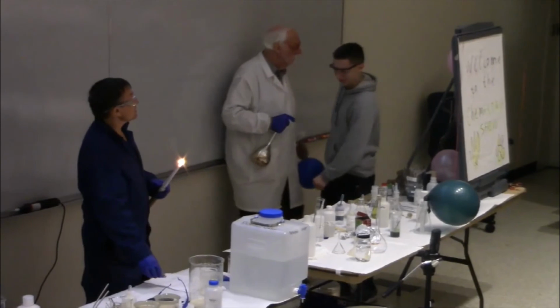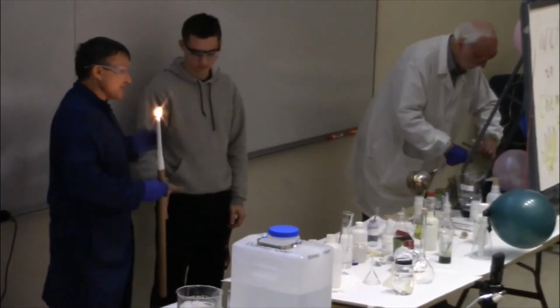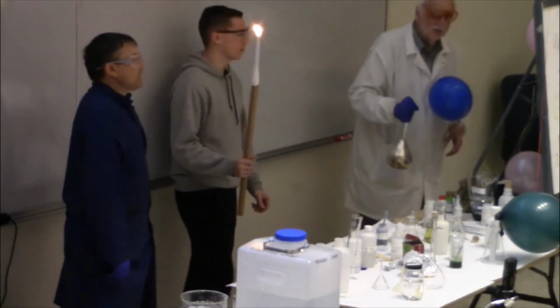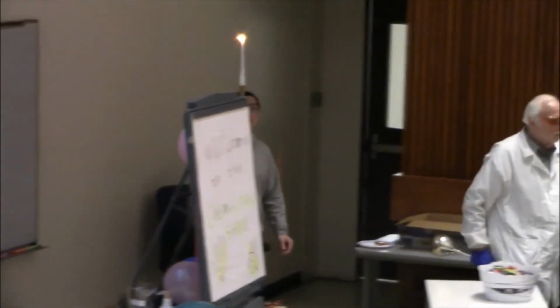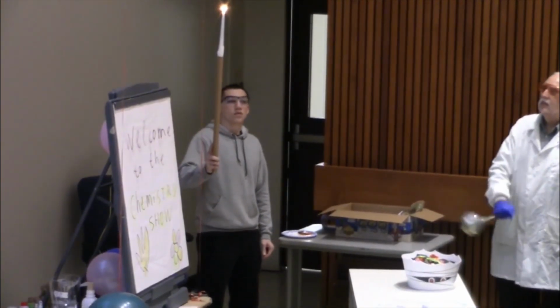Now, the next one is filled with hydrogen, and we have an expert on explosions, Jordan Kostera, and he's going to do that little balloon. So be prepared, it's going to be very, very loud. All right, are you ready? Let's do it.